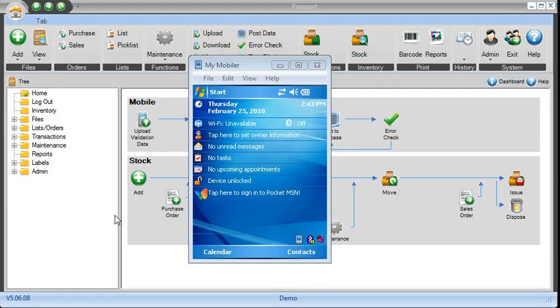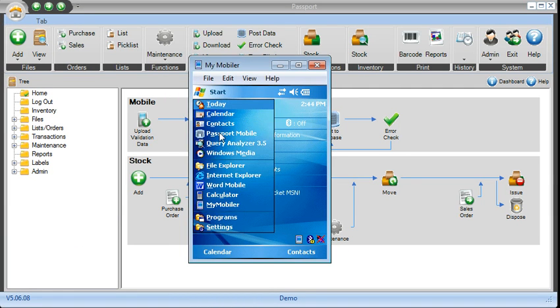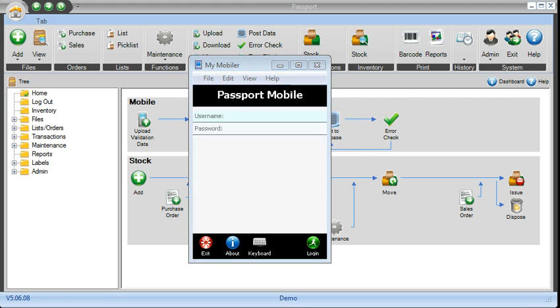On a day-to-day basis, you pick up our barcode scanner, click on Start, launch our application, login with your username and password.